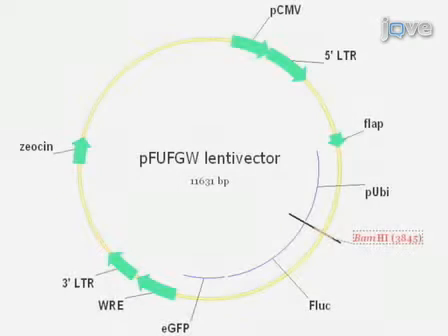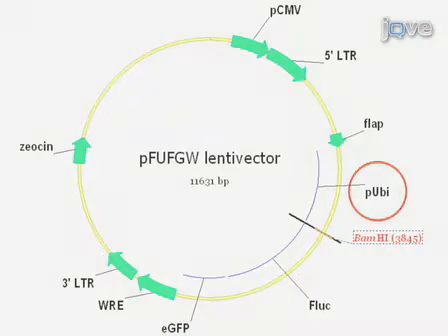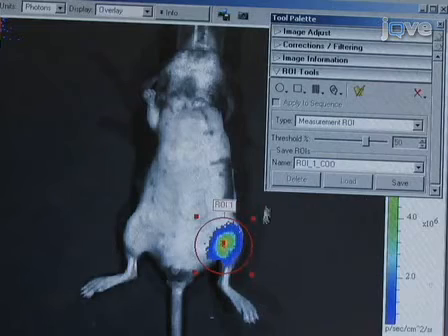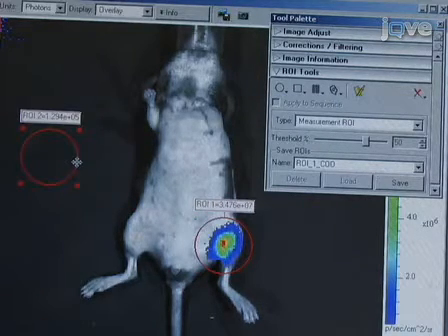The transplanted ESC-derived endothelial cells were modified to express both the firefly luciferase gene and the enhanced green fluorescence protein fusion gene under the control of an internal ubiquitin promoter. Therefore, bioluminescence can be used to track the cells within the ischemic hind limb.